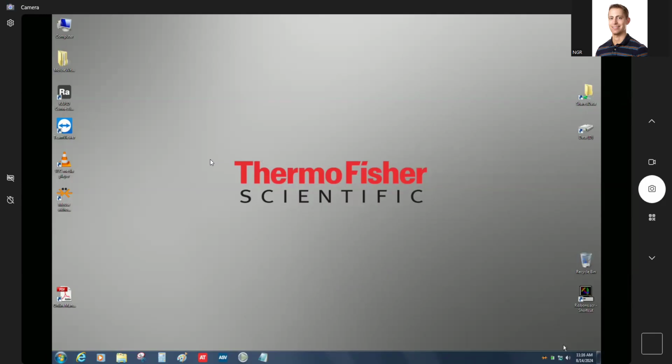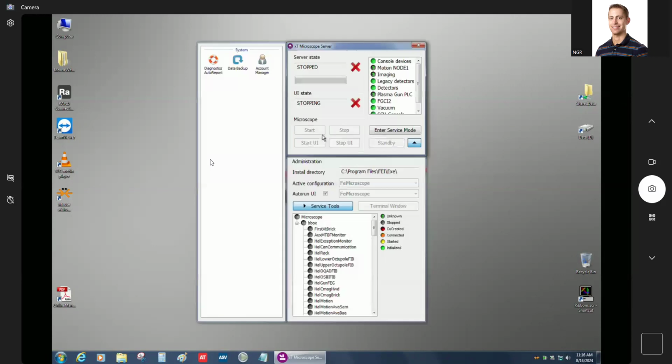So this is still giving... All right, let's go ahead and boot this up. I'm gonna double left click on here. Okay, perfect. Yeah, so I waited long enough so it didn't hang. All right, so then we're just gonna click start, and it's gonna boot up all these bricks.